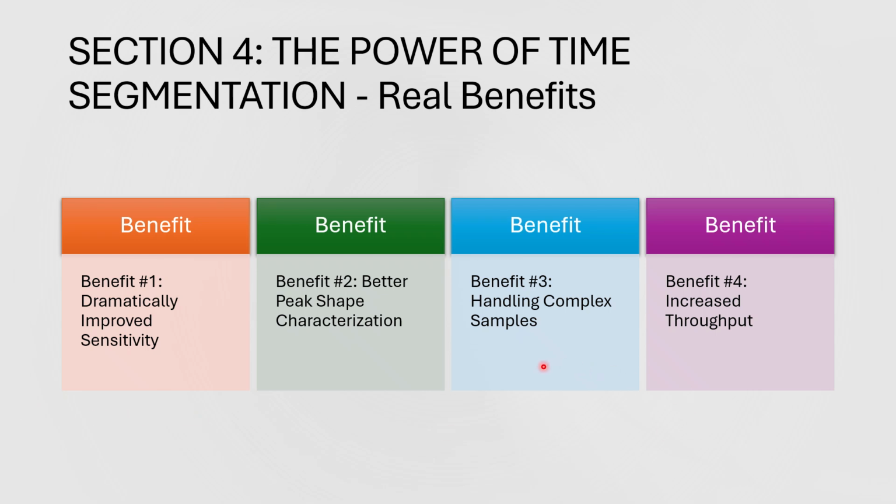Third is handling complex samples. Dynamic MRM methods, which use the time segmentation principle, can accurately quantify hundreds of individual analytes plus their internal standards and qualifier ions in a relatively short LC run.